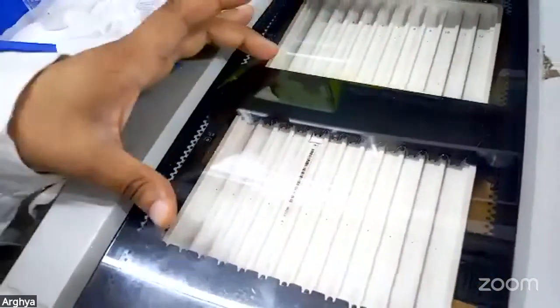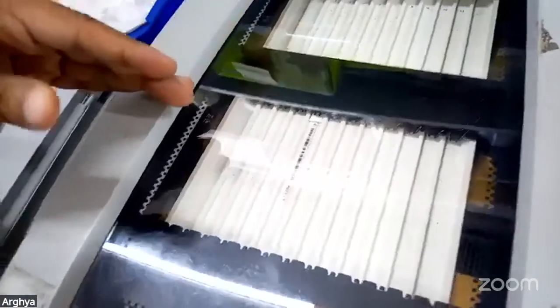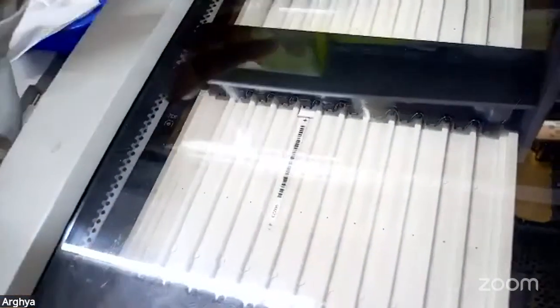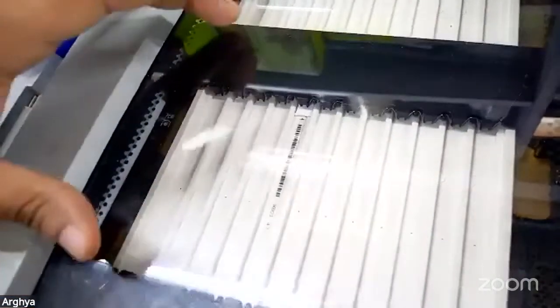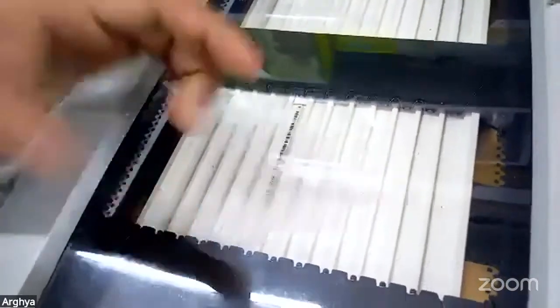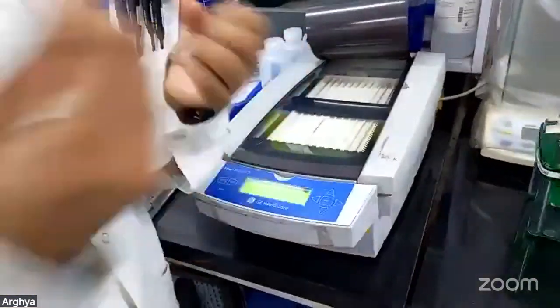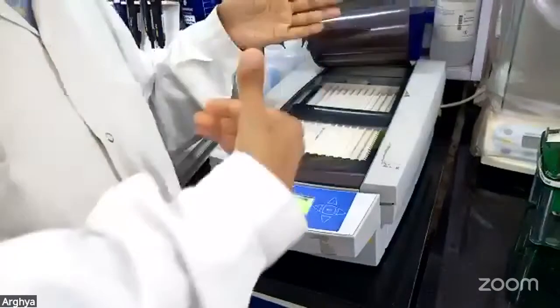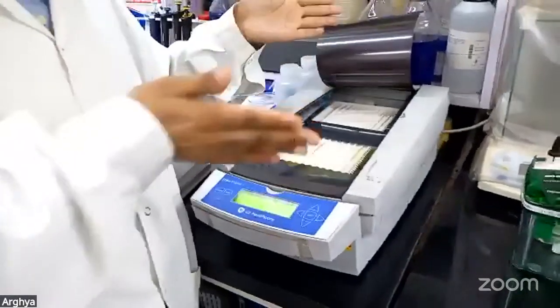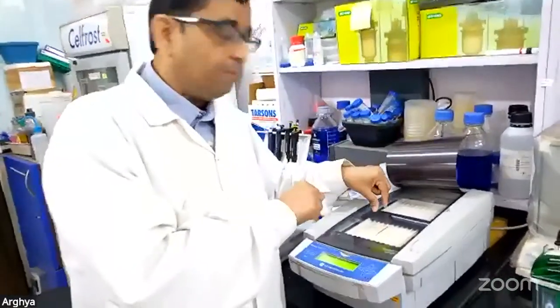The best part of this particular setup is that it's very flexible. You can change the electrode and need not use different trays for that matter. You can use the same tray and use different lengths. As you've already seen, there are 2 paper bits put on the sides. They are absorbing all the salt. So during the isoelectric focusing run, any contaminants usually come out from the strip and are absorbed towards the edge on these paper bits.